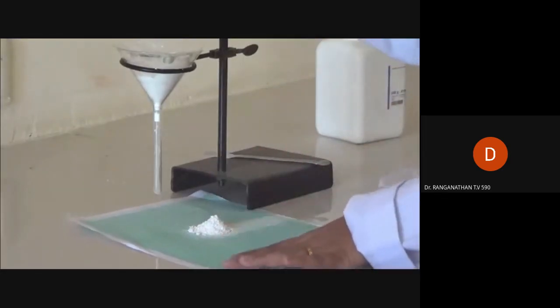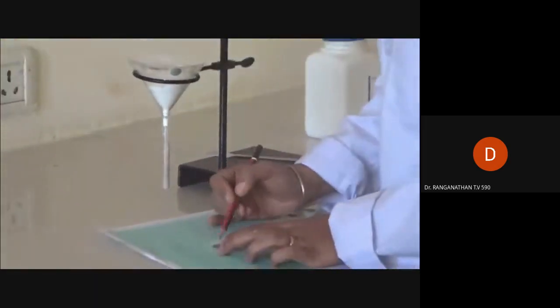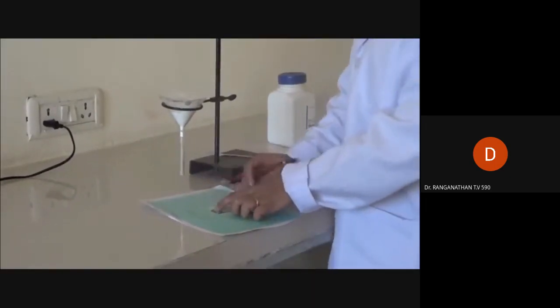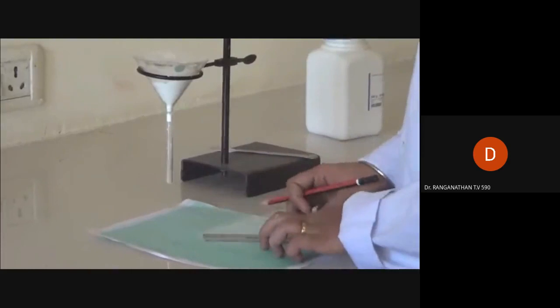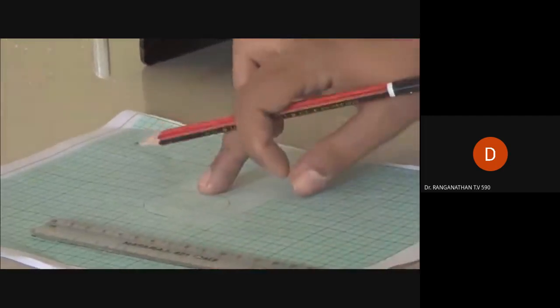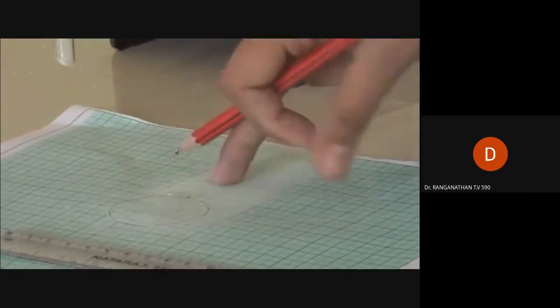After that, remove the powder and calculate the diameter of the circle. Now here the diameter is 4.2 centimeter. Take the diameter from different points. This is also 4.1 centimeter and 4.1 centimeter. So we will record the diameters 3 times, that is 4.2, 4.1 and 4.1 centimeter.